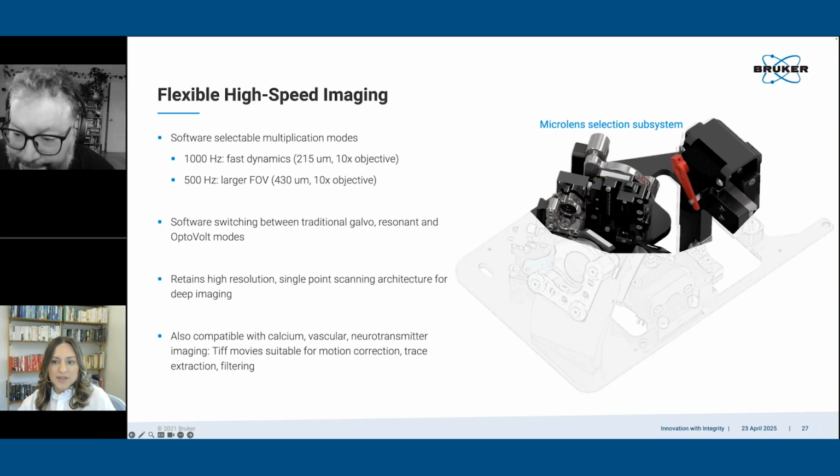Okay, the next question is asking for a better field of view and DOV. I'm not sure if that's a familiar acronym to you, Kevin. Is it referring to the depth of field? Depth of field? Okay, with DOV. So for a better field of view and DOV, if this is your question, feel free to clarify. I'll watch your response. Can we use a customized transmission grating? They mentioned this is cost friendly instead of the more expensive DMD or SLM. How much would using a customized transmission grating compromise the resolution of the image?